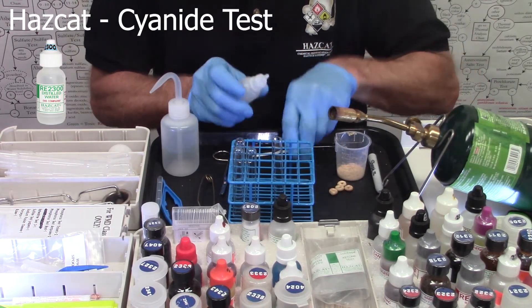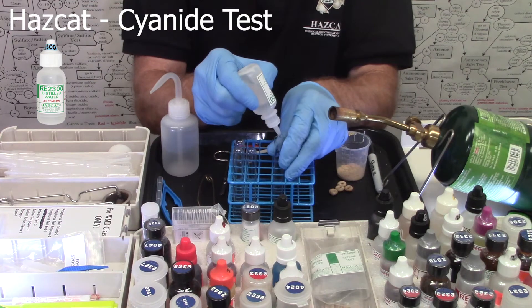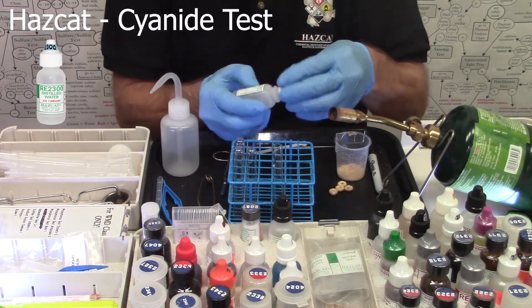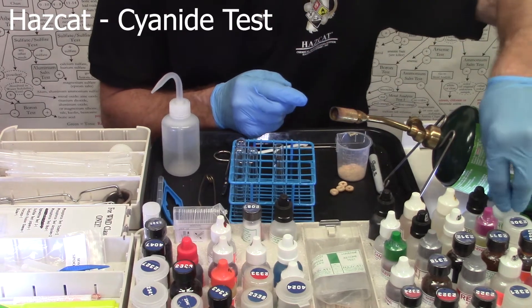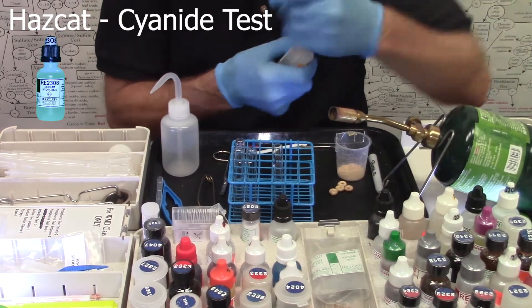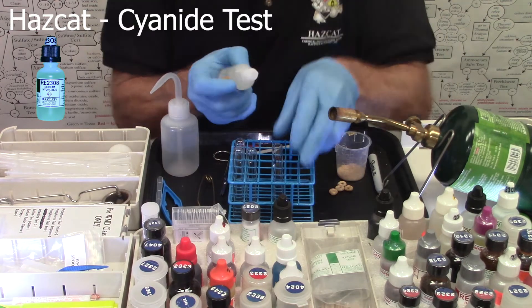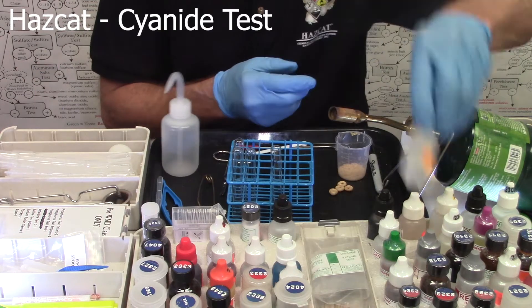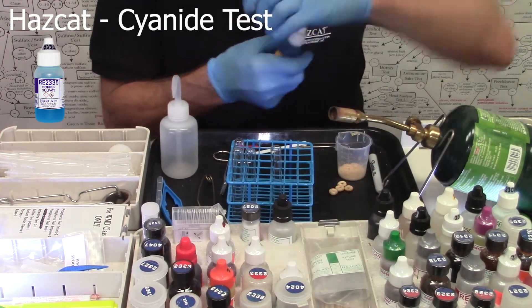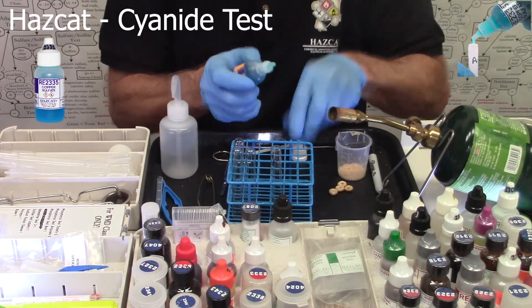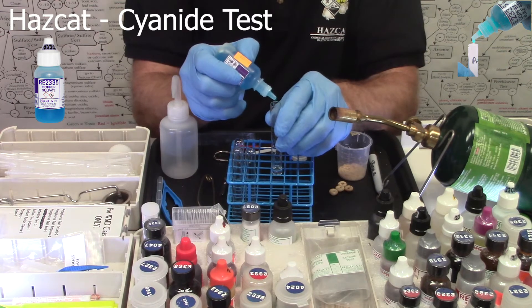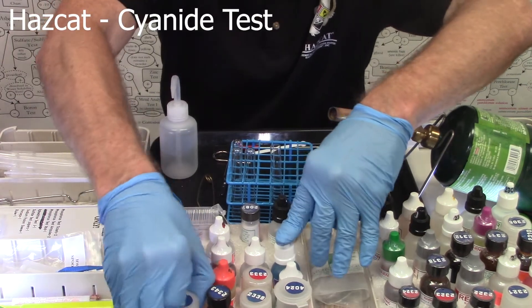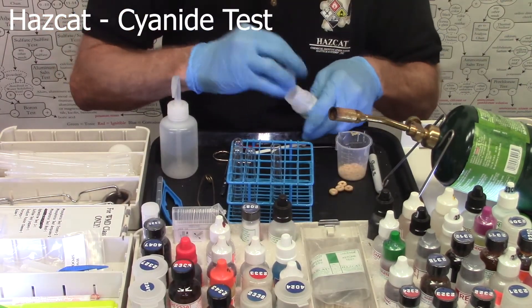We'll add one half inch of RE2300 distilled water. We're going to add two drops of RE2308, three drops of RE2335 copper sulfate solution, and one half spoonful of ammonium molybdate solid RE2344.